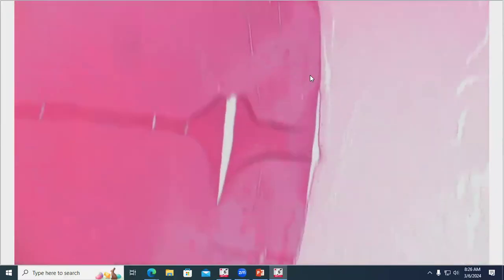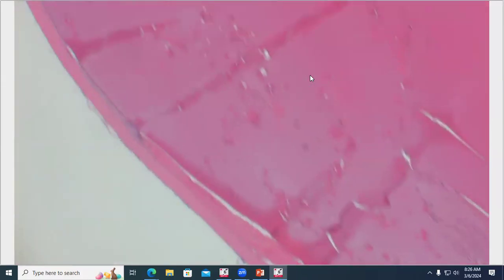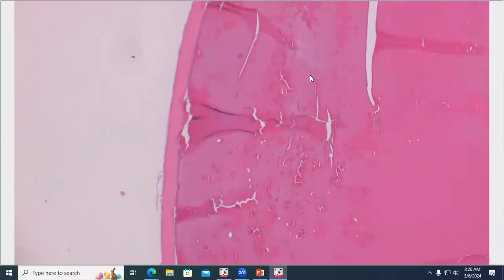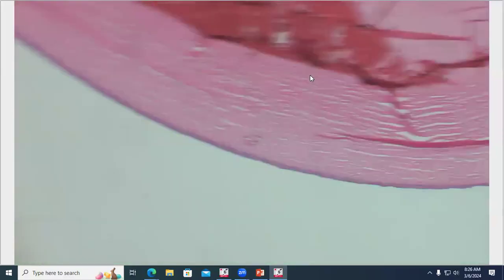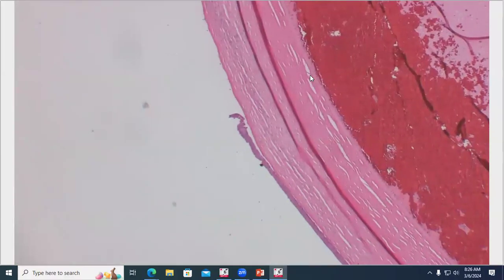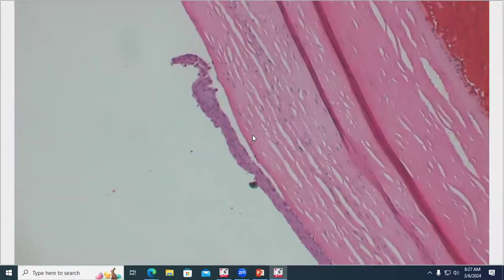If we go back to the lens, it does have some cataractous change to it, but the lens capsule was intact. There was no evidence of inflammatory infiltrate in here, so no evidence of a rupture of the lens capsule, but still some cataractous change. And then we can confirm there's an ulcer of the cornea here. We've got the epithelium lifting off a little bit at the edge. It's a little bit rounded and maybe a little bit disorganized. So an indolent ulcer also in this cat, which is not unsurprising to find here.